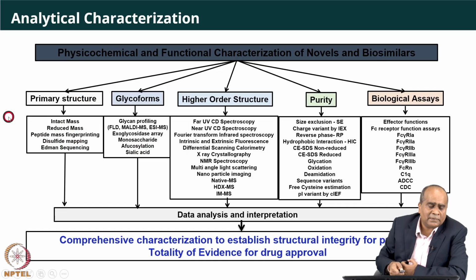You see, you require a very expert team here, right. Then comes the complexity in glycoform analysis, which has to be done again robustly. Here you also require very expert mass spec operators, data analytics and all those. Tons of data is emerging, and now that data analysis and interpretation becomes very important.